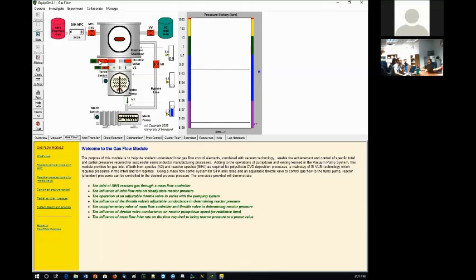So let's set that to 50, okay? I think you can write it on top now. Yeah, the exact number is not extremely important, like 51. That's what I found.